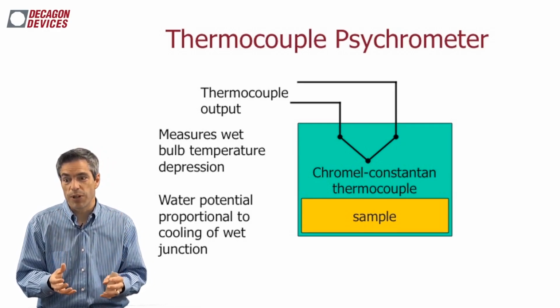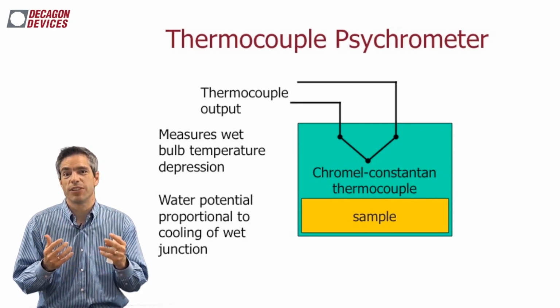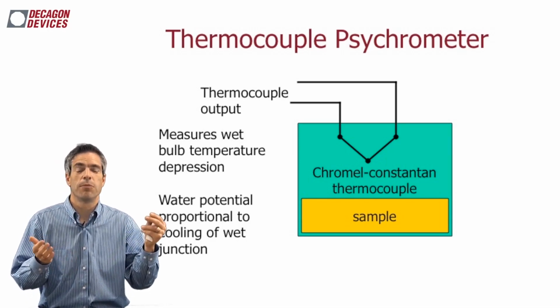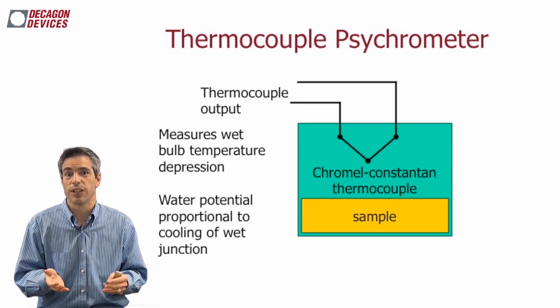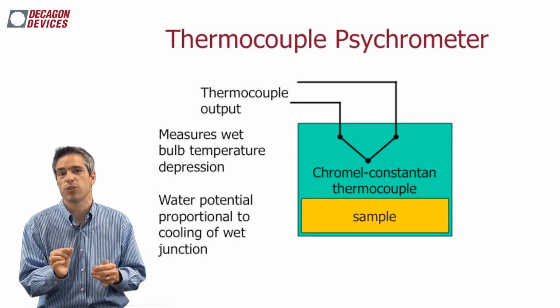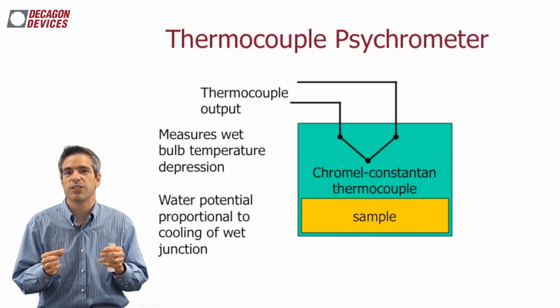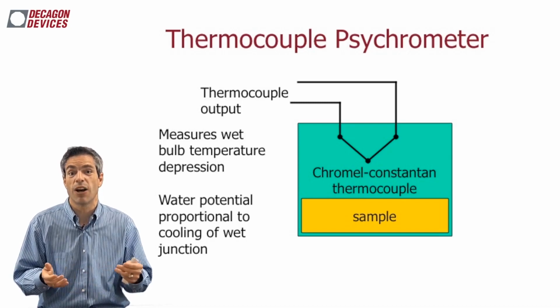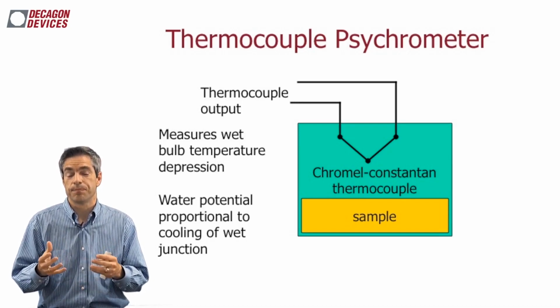When we make this temperature measurement, we have to do it extremely accurately. We don't have the choice to just go put a thermometer in there and guess at, maybe a half a degree C. We're talking 1/1000th of a degree C. And so a very small temperature sensor is required. The only thing that can really do that is a thermocouple, and maybe there might be another technique to do that now, but certainly that was the best one back then.